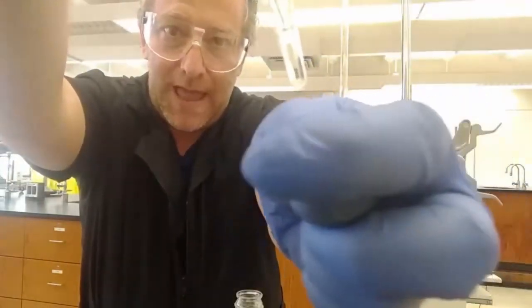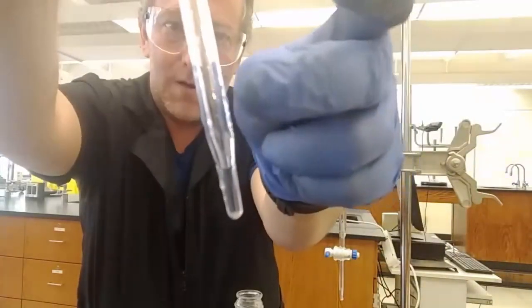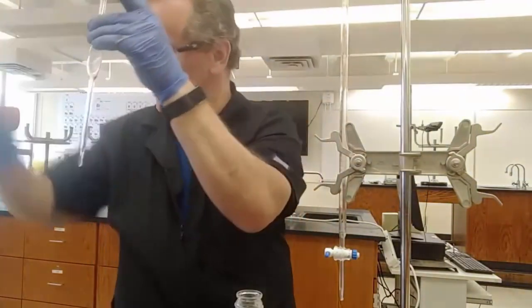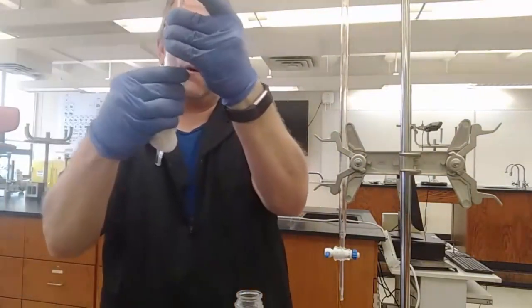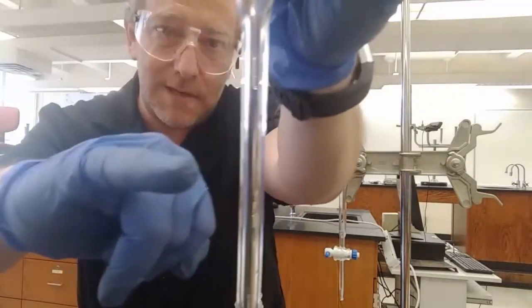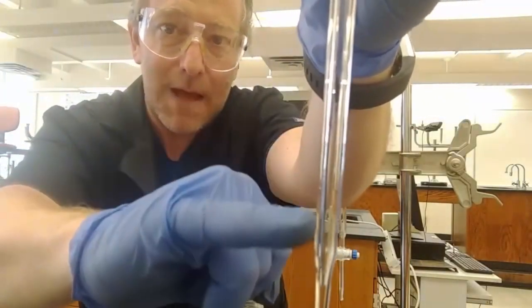There's no bulge, nothing hanging off the tip. This is exactly delivered 10 milliliters. Now, there's a drop on the outside from where I had it in the vinegar. Just clean that off with a paper towel to see if there's anything on the inside. And in fact, there is, okay? There's drops of vinegar inside the pipette.